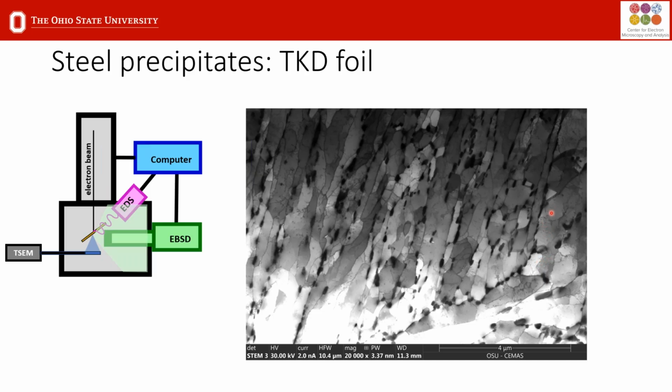So these are dislocations that might not necessarily cause a rotation of the crystal, and they will be invisible for EBSD analysis. So by combining this transmission mode with orientation analysis, that will allow us to see the total dislocation density in this particular material.